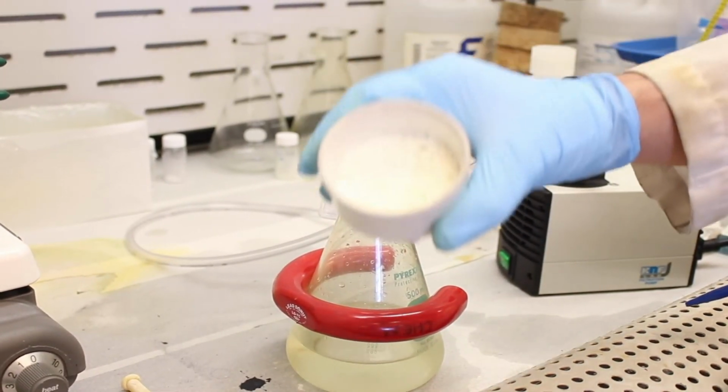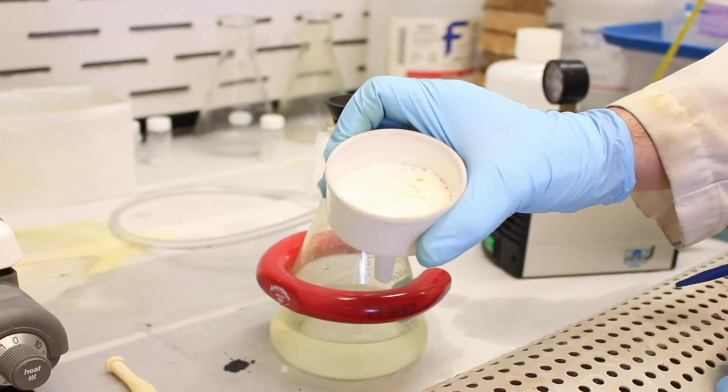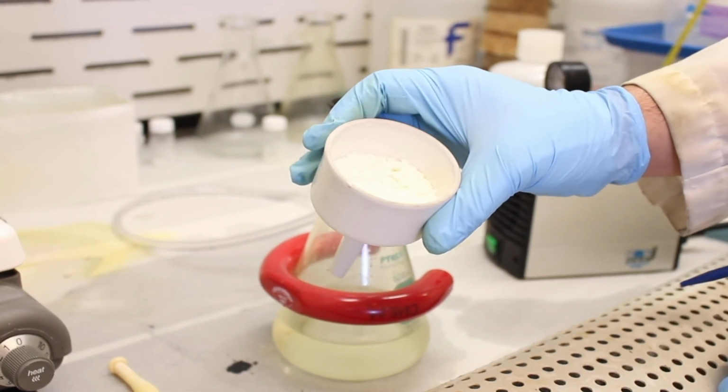So we have some solids on the filter, quite a bit actually. We started with a lot of material, right? 6.8 grams, so we're expecting quite a bit.